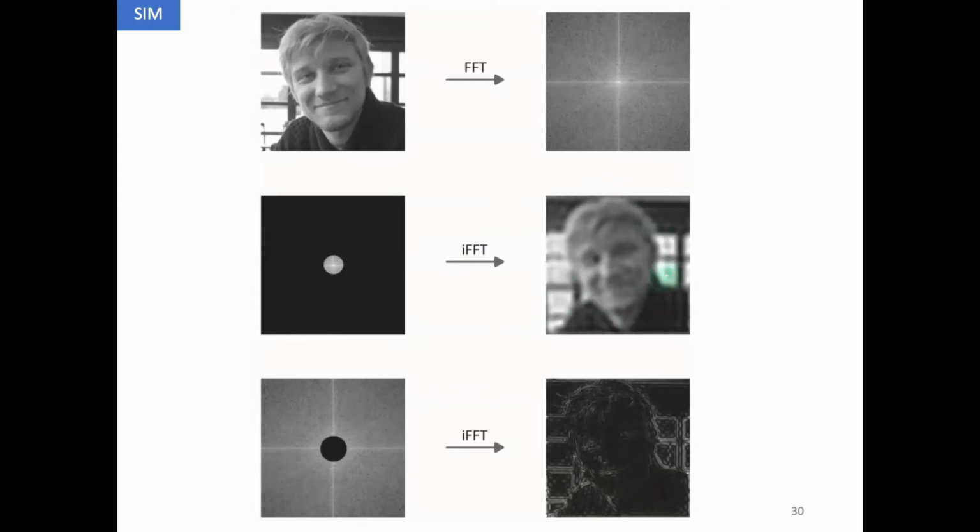We end up with a blurry image, which is what happens in microscopy. There's a limit to what you can see with microscopy. You can see that other information is not captured, but if you transform that back, you still have another type of information that we lost because we were imaging with this numerical aperture.